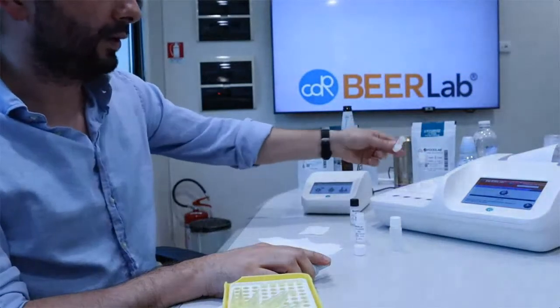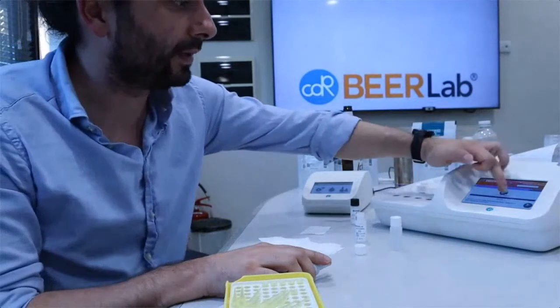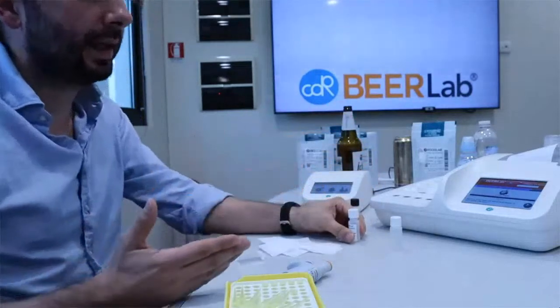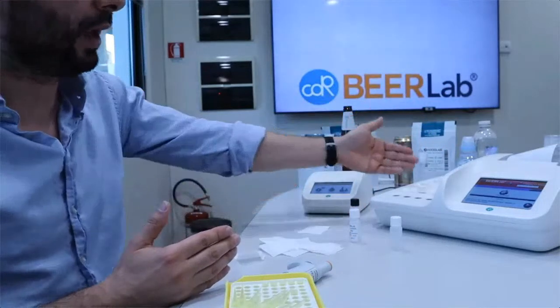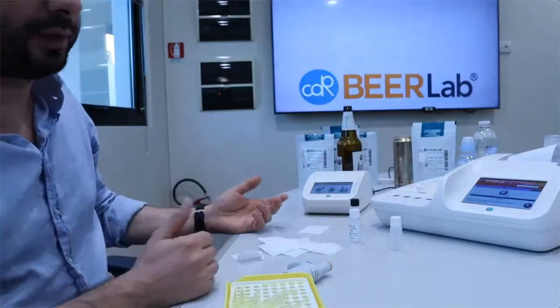We shake by inversion, and we press, and we start the timer. Okay. Practically, the analysis is finished. Now we have just to wait 10 minutes. We have to read back the cuvette into the reading cell, and we will have the result.